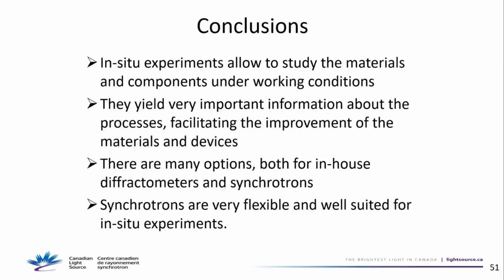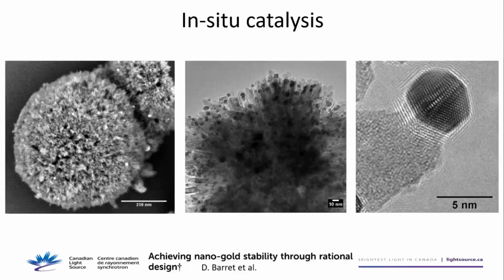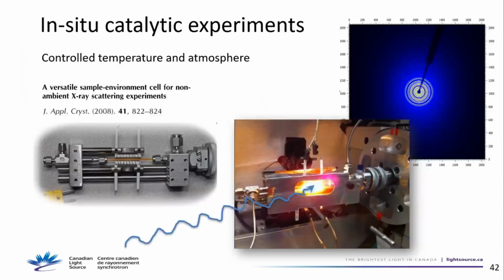Yes. We can do it in the capillary cell that we will show here. The gas comes in on one end and goes out on the other end. And these are resistance heaters, so you can heat it. And the IBM station, you can go to 1,000 degrees, but ultra high purity gases only. So if you want to use dirty or toxic gases, you'll use this one.